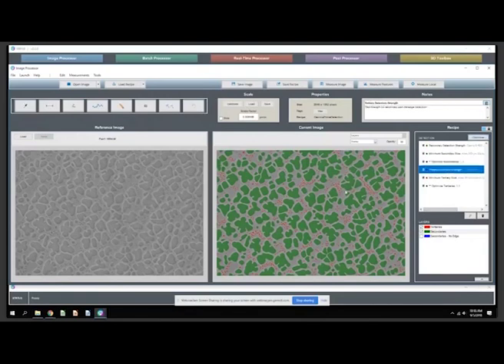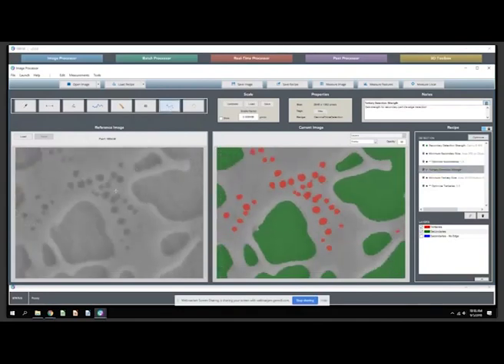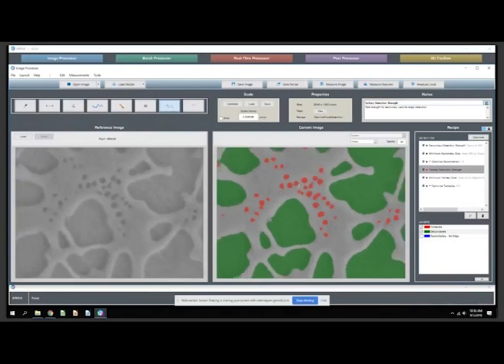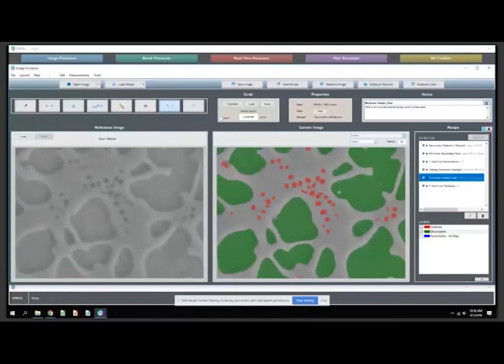Then the tertiaries here, finding these fine particles was challenging for any product, but our local thresholding allowed these very subtle local intensity differences to be picked up on and properly identified the particles as such. Again, we have a minimum size cutoff here for the tertiaries.